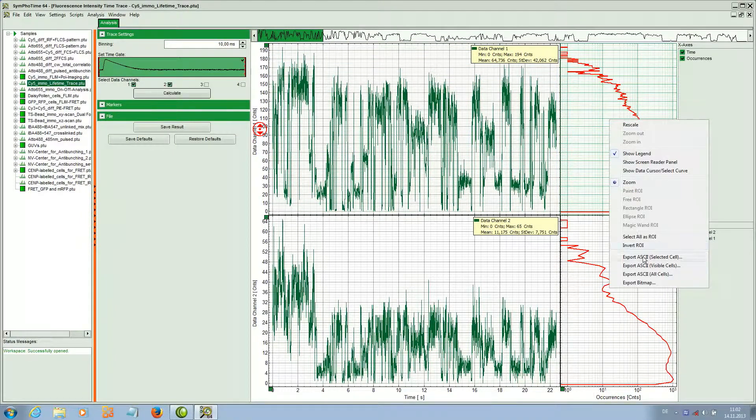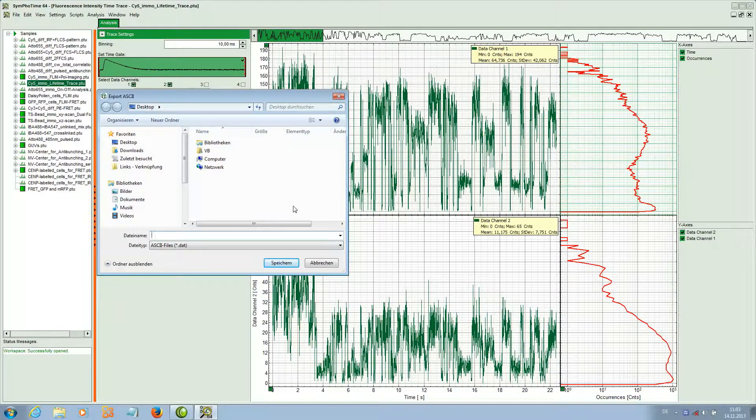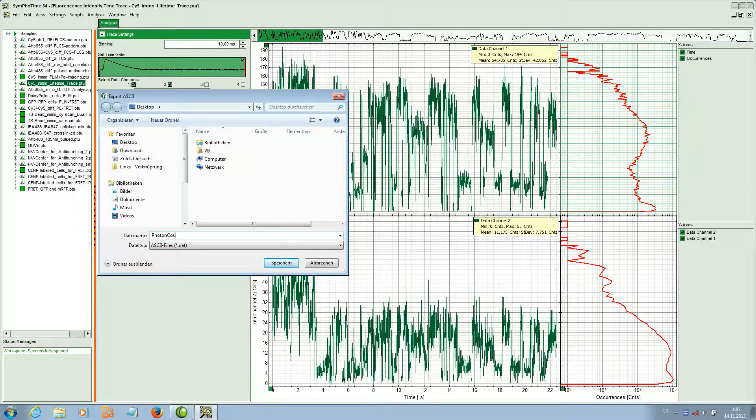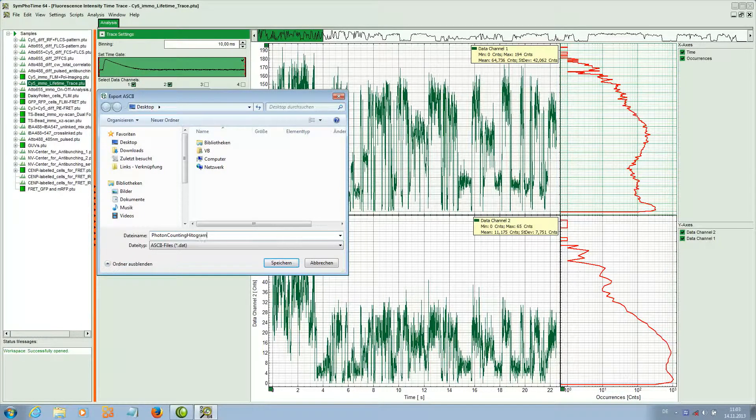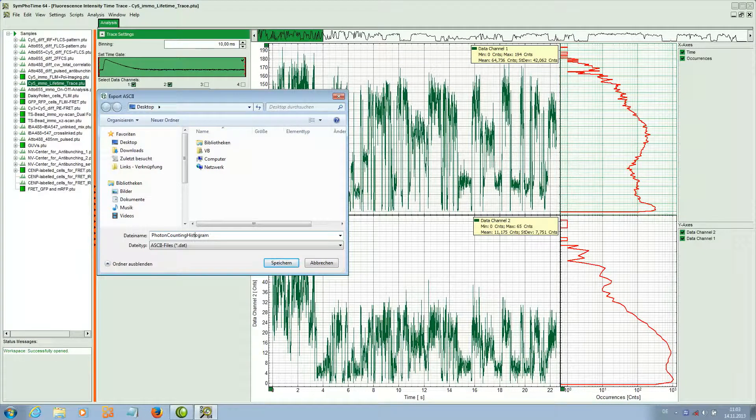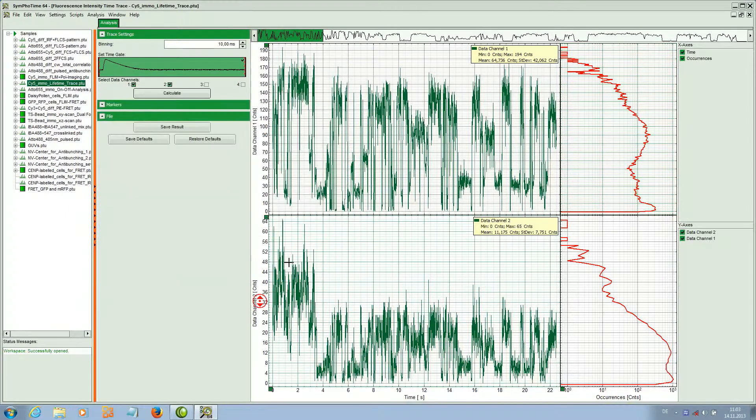It is also possible to export as an ASCII file, for example the photon counting histogram, to process this with another software and to fit the data.